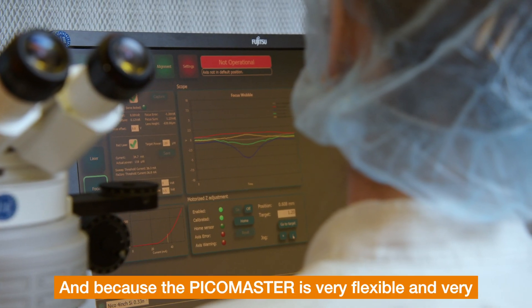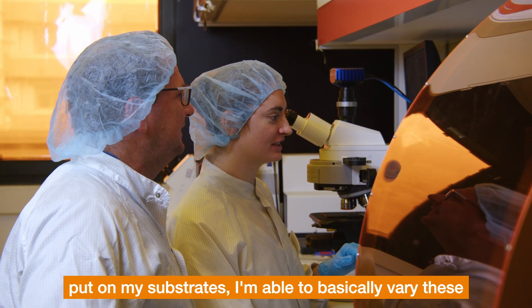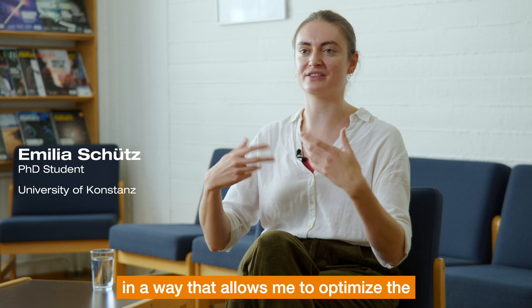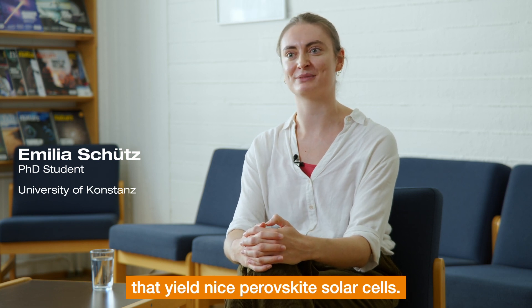Because the PicoMaster is very flexible and versatile in the patterns I can put on my substrates, I'm able to vary these nucleation patterns in a way that allows me to optimize the parameters I'm choosing, and hopefully achieve very nice films that yield high-quality perovskite solar cells.